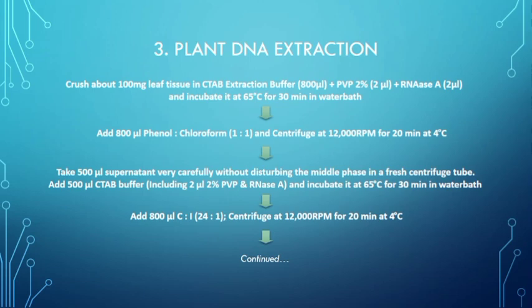In this centrifugation you can change the time: if you are doing it for a shorter duration, centrifuge at a higher speed, or if your rpm is low, then go for 20 or 25 minutes or so.